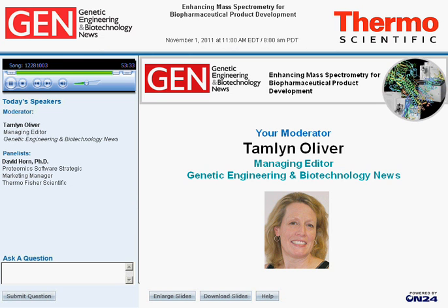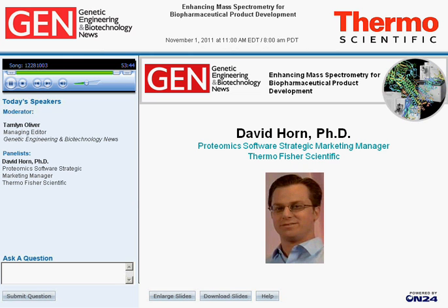Okay. And we actually just have time for one more question, and it is, ETD performance could be lowered due to tighter folding, disulfides? Yeah, that's a good point. I neglected to talk about that, but yeah, in this case, the HCD data was probably better than the ETD data because disulfides are known to have high electron capture affinity. So some proportion of the electrons that are being transferred go into breaking disulfides and not breaking the backbone. So that did decrease the efficiency of that reaction a little bit relative to HCD. In general, when there isn't a disulfide, when there isn't something that is kind of an electron sink, ETD should be producing more sequence coverage than the collisional activation techniques.